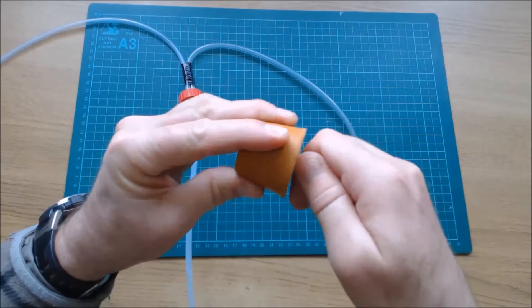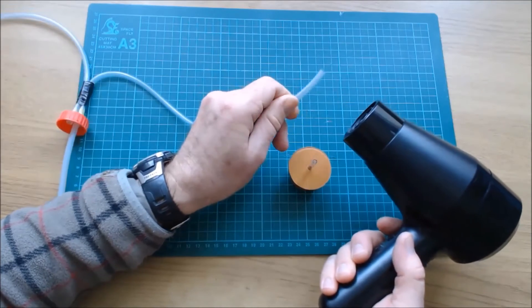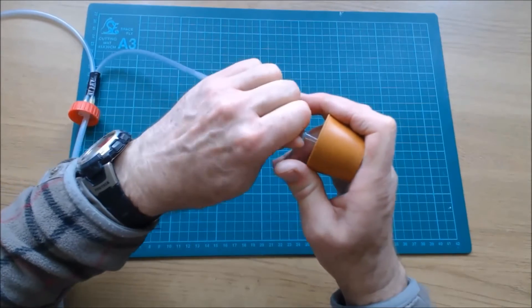The pipe connects to a glass soda straw which is pushed through the rubber stopper. Heat the pipe to make it more flexible and then push the pipe over the glass soda straw.